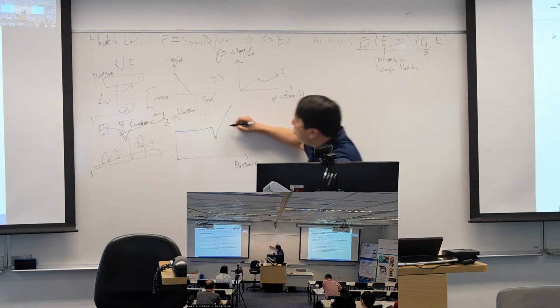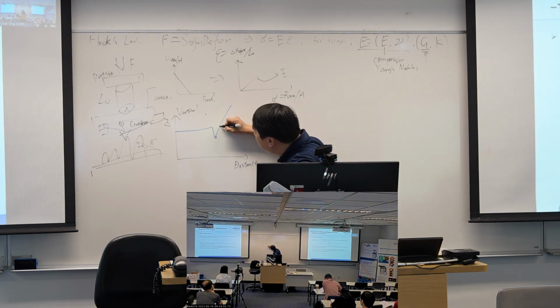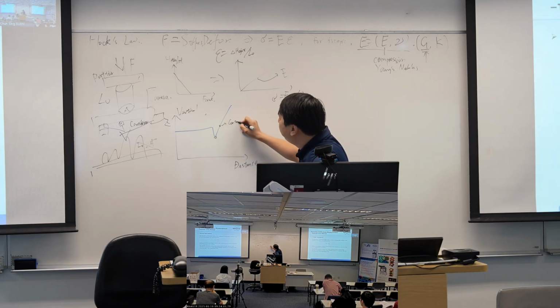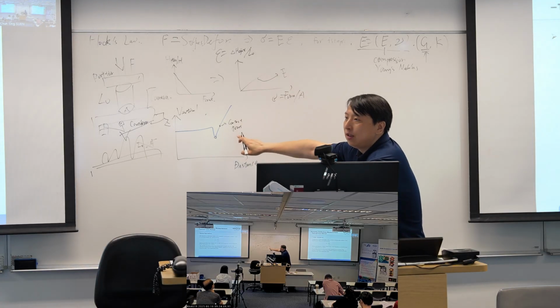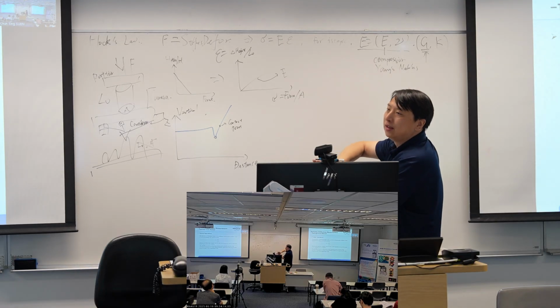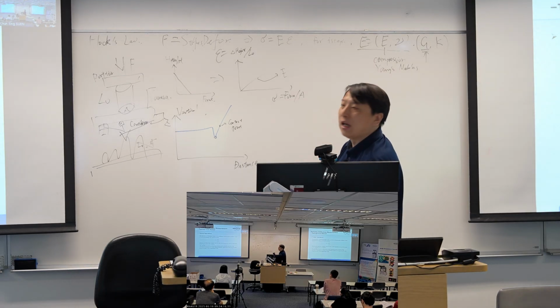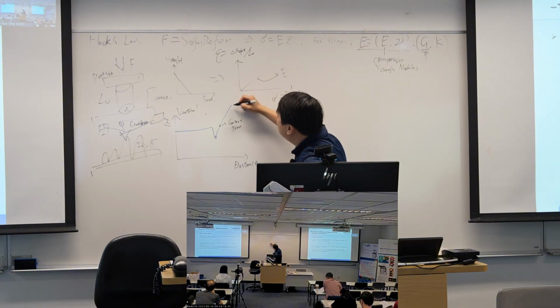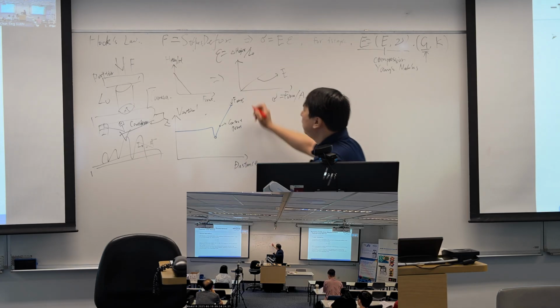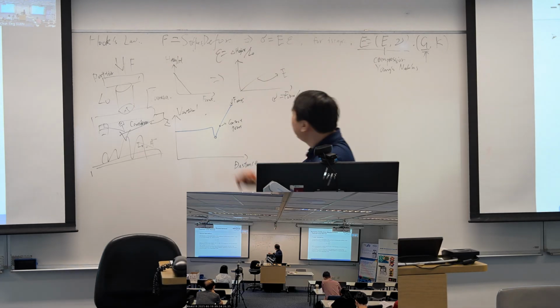And usually we would define this point as a contact point. And after that, we think the sample has been compressed. It has a deformation. And we would apply force to reach our maximum force. And after that, the probe will retract.